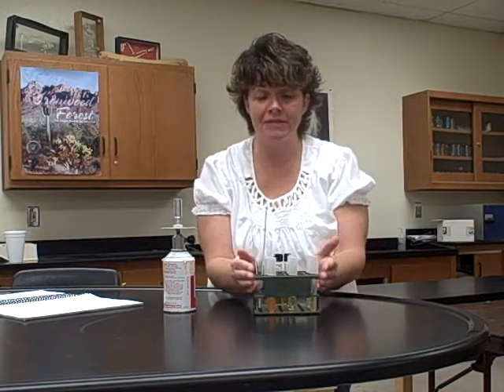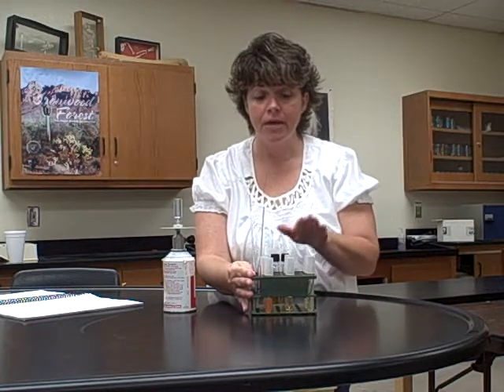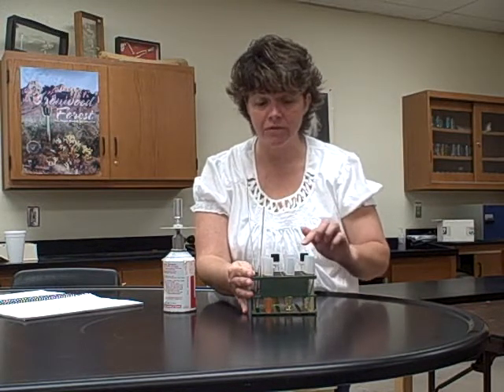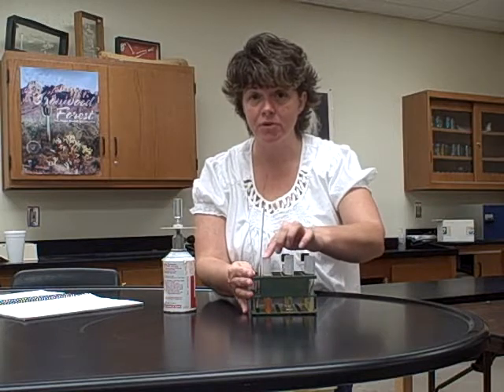Now, when we do this, you're going to be working in groups of no more than 3 people, okay? And I want every person in the group to be doing their own inoculation. What that means is I don't want each person to have a separate set of tubes. I want each group to have the 12 tubes, the 9 that you're putting into and the 3 bacteria, but I want each person doing a transfer, okay? So maybe person A is responsible for transferring Lactococcus lactis into these 3 tubes, person B is transferring the Pseudomonas, and person C is transferring the Proteus vulgaris.